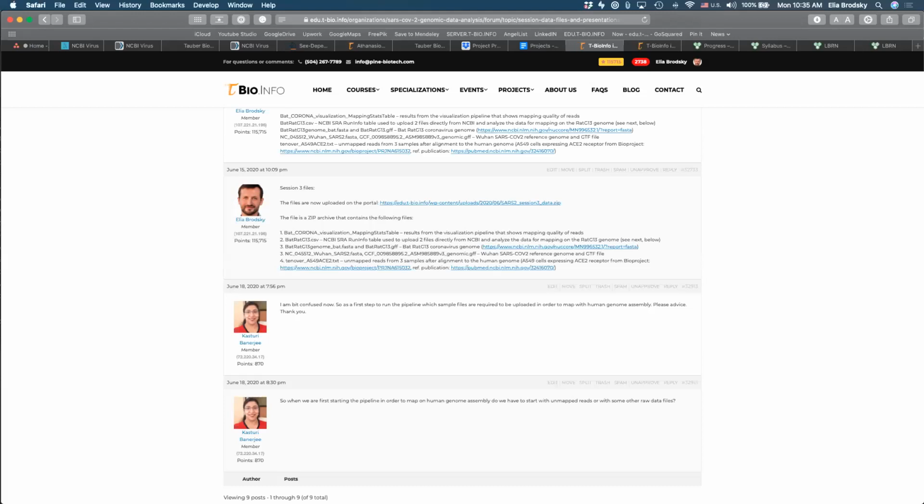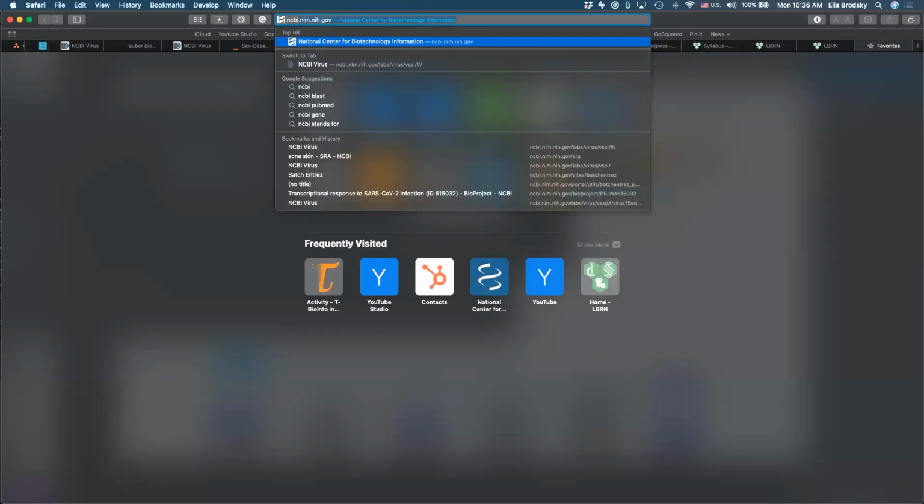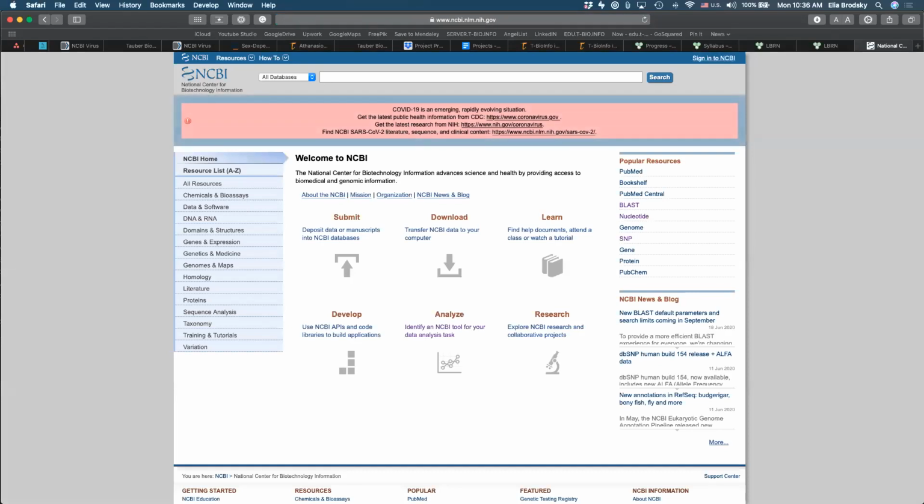So I think I showed it in session 3. I don't want everyone to go out and get hundreds of samples right now and start uploading them to the platform to run them. So please don't do this, but I will show you how to do this since everyone is asking. If many of you start doing this at the same time, it will just slow us all down. So let's wait until we get to the stage of projects, and we'll actually tell you specifically if you're ready to do that. So please hold off on this, but I'll just show you as an example.